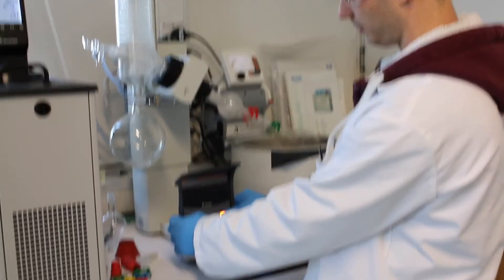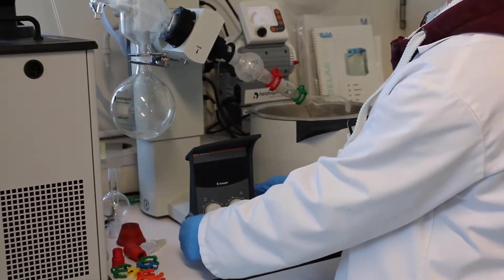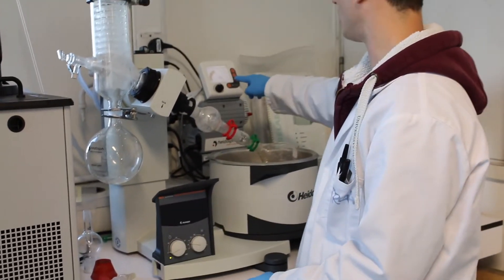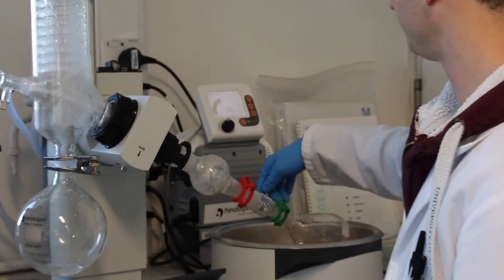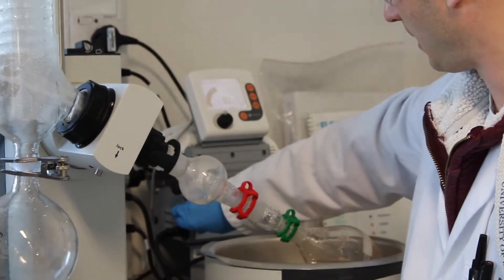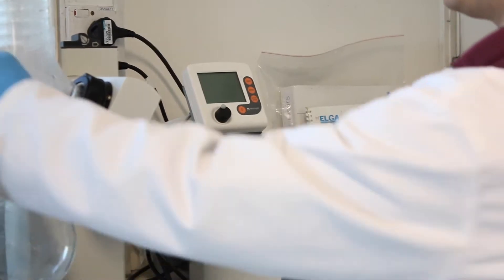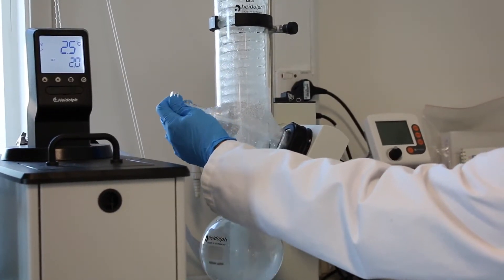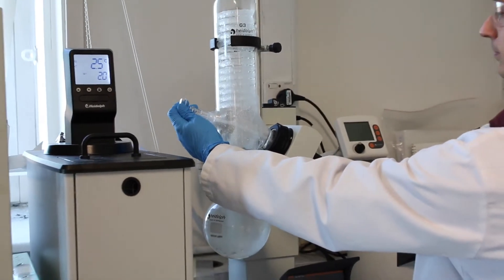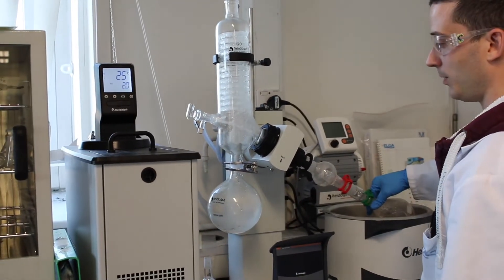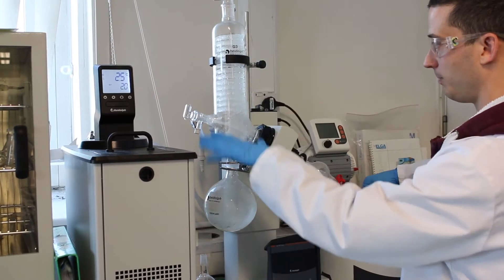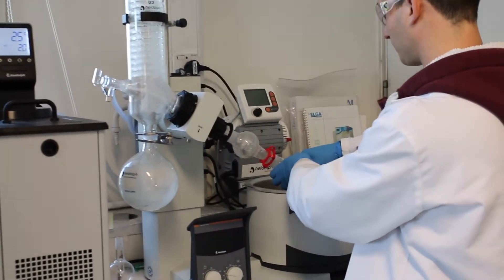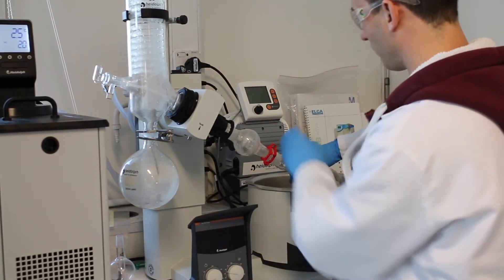Now we can turn off the rotary evaporator. We're going to turn off the pump, the main switch, and now we're going to vent the system. Hold your flask. Wait until pressure is stabilized, and now you can remove your flask carefully.